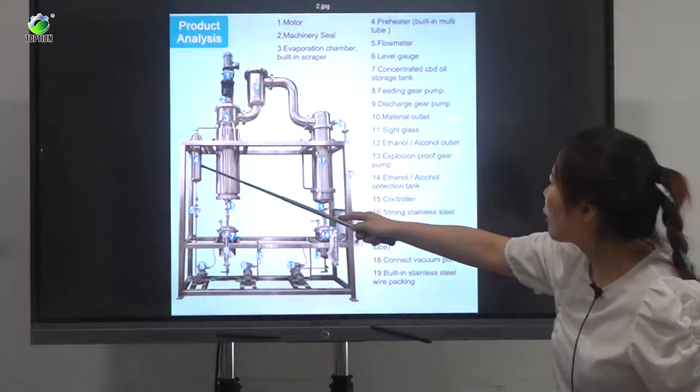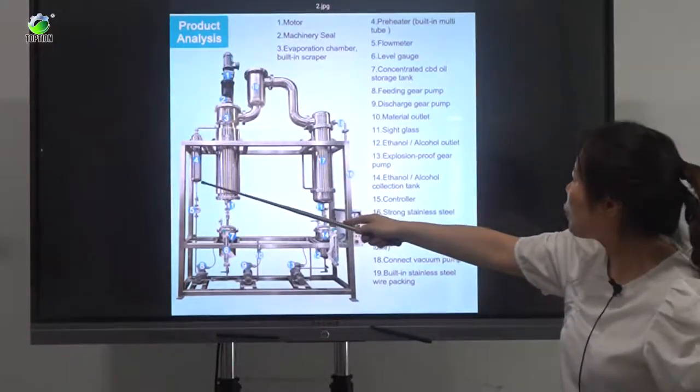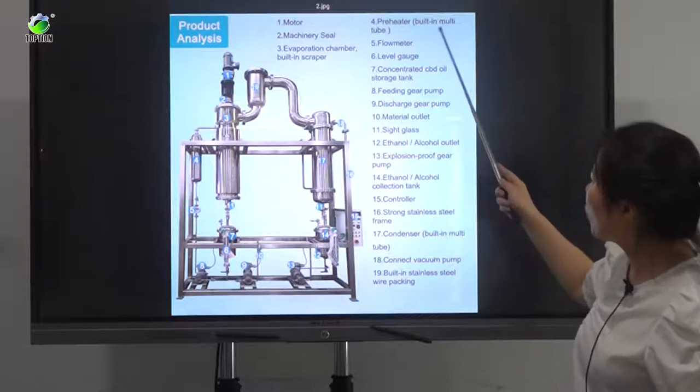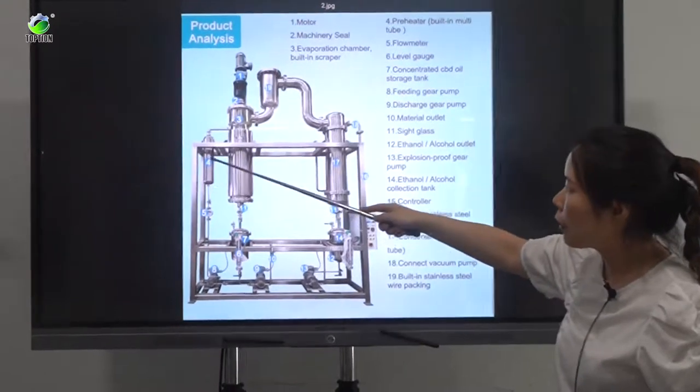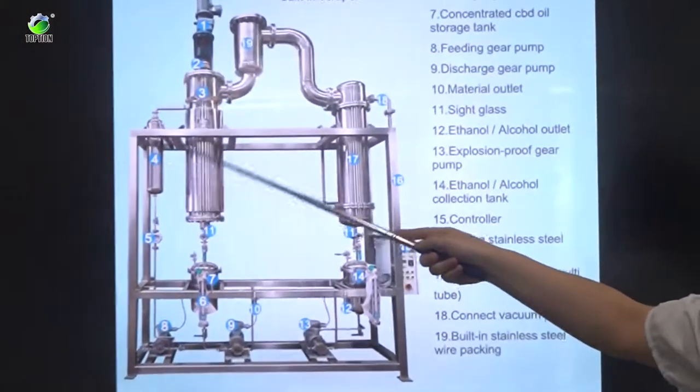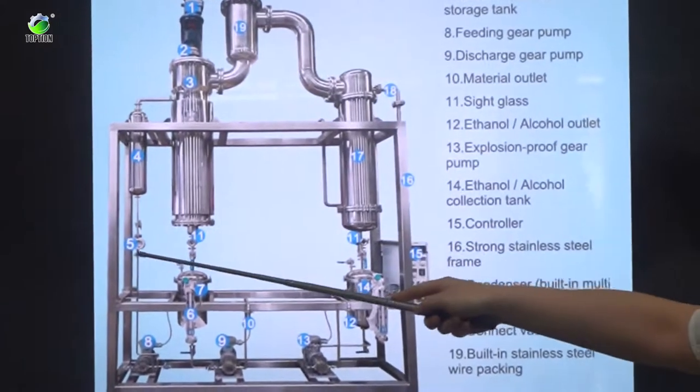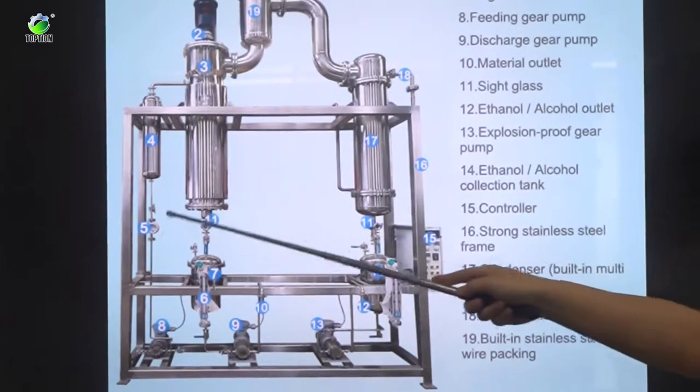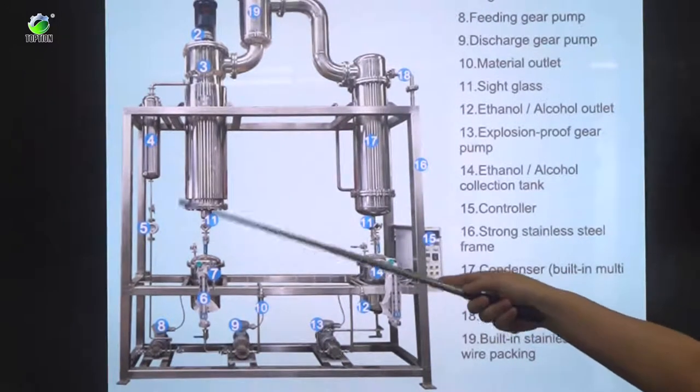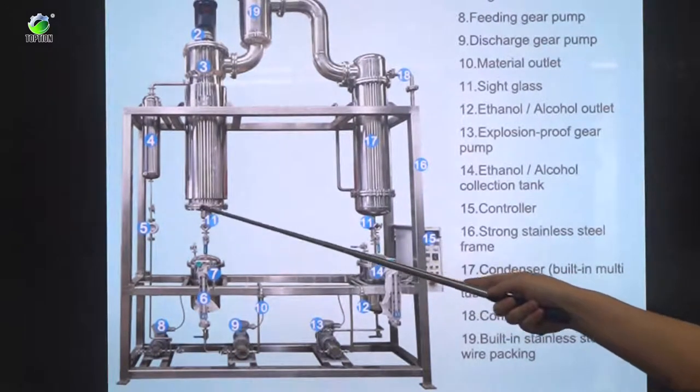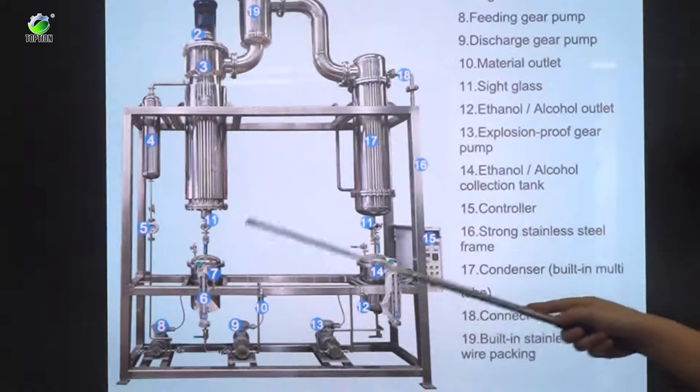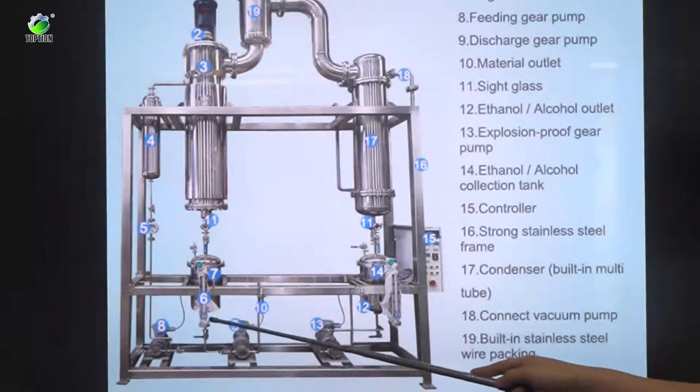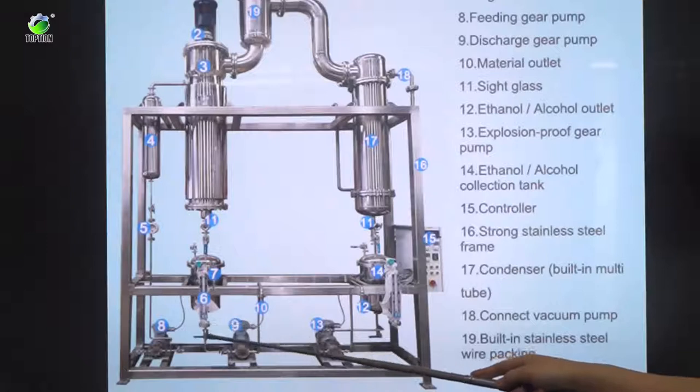And this fourth is pre-heater. With this pre-heater we built in multi-tubes here to heat the material. And this fifth part is a flow meter. From this flow meter you can see the liquid value. And the sixth one is level gauge.